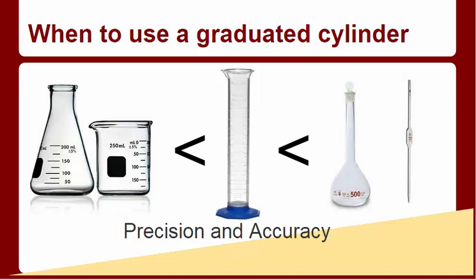Yeah, I've seen people do that. And I know that for beakers and flasks, they don't really represent the actual milliliters. It's kind of an approximation. And so that's really bad to use those.